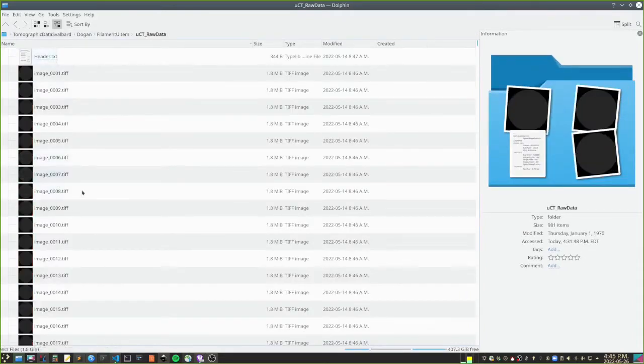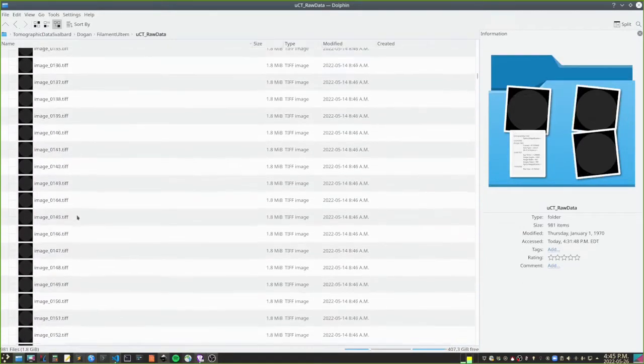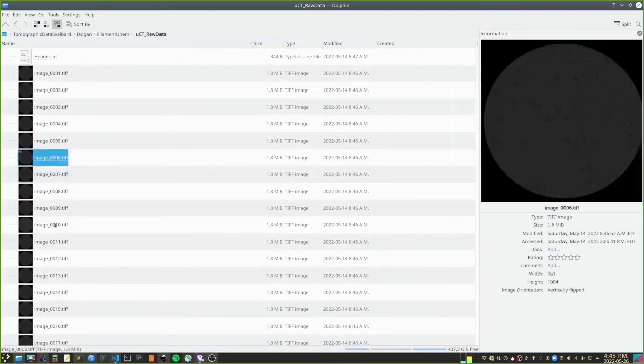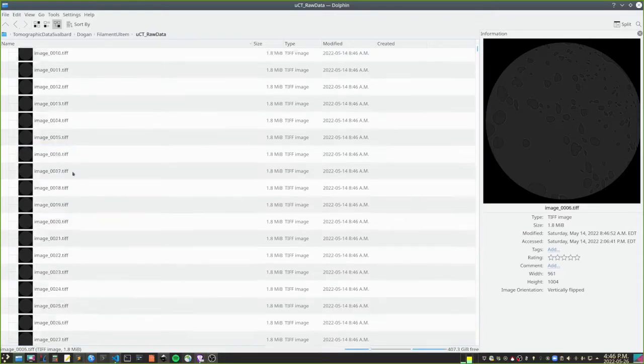And inside here, depending on what system you use or exactly what options you use to generate your pictures, your slices, there's going to be a different naming convention. For our system, there's always 4 numbers and some prefix. So I made the code so that it finds the prefix automatically, so you won't have to worry about that.